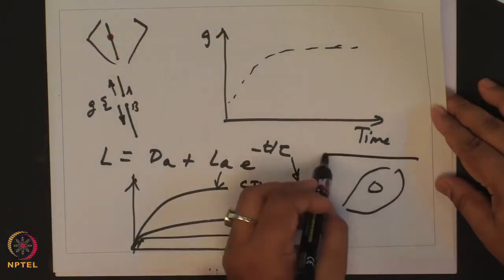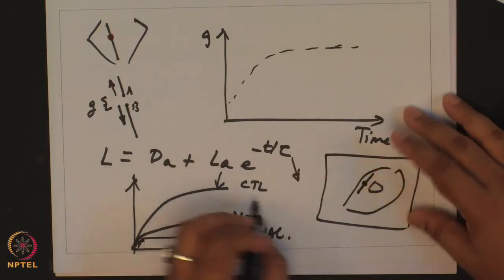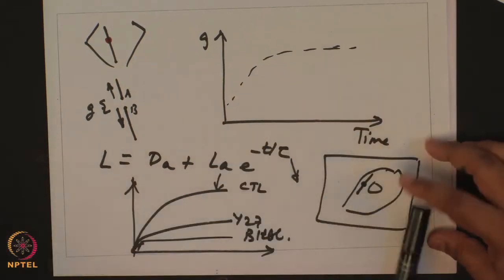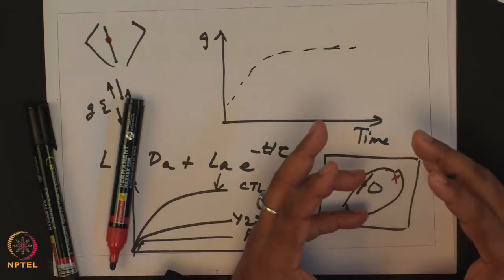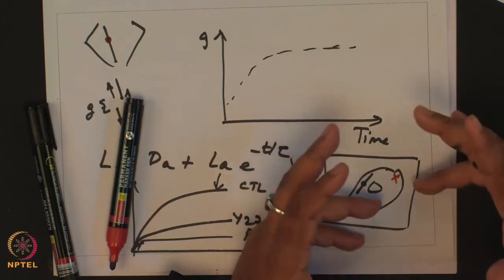Using this experiment, Sanjay Kumar demonstrated that when a cell is sitting on a compliant substrate and a single stress fiber is ablated, the substrate acts as an elastic link for two different points within the cell. So, even if you ablate a single stress fiber, there is global rearrangement in the cell as a consequence of that single ablation, but this is markedly absent if the cell was cultured on a glass substrate.